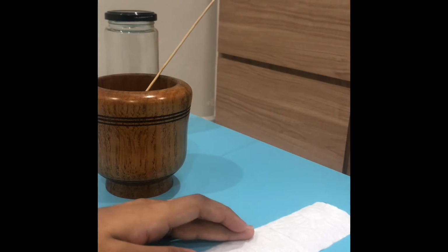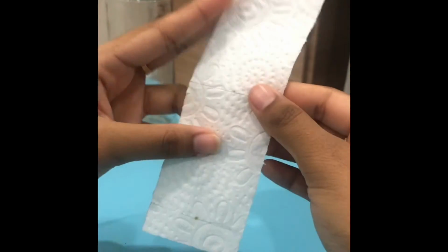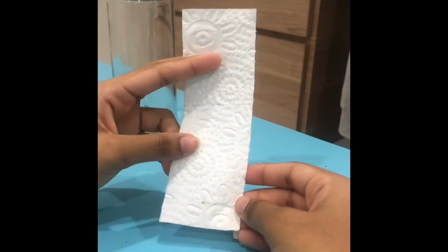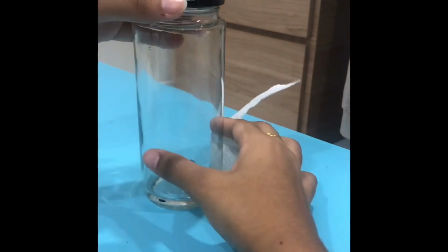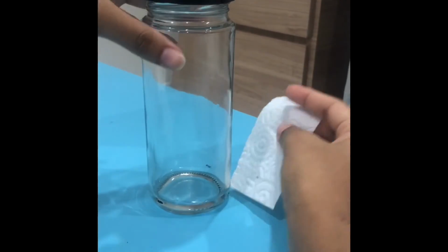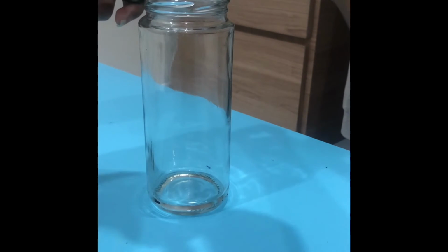make it larger. So after I have managed to darken the spot, we will move on to placing it in the chamber. Okay, so right now I've been able to get a bit of a concentrated dot. So now this is the chamber and I'll be placing it in the chamber for the next task. So putting it right into the chamber.